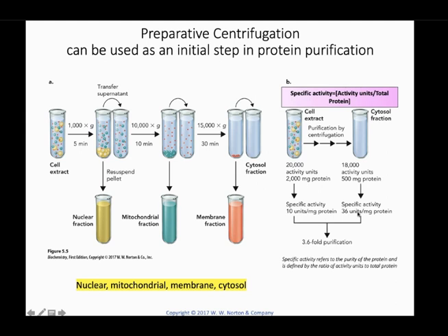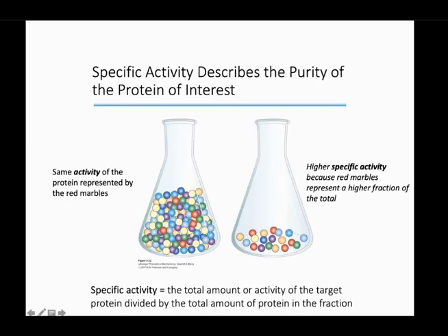Okay, so you're going to be purifying in all the steps that you have to do. And here's basically how they explain. So you have your protein. Imagine that you're looking for this protein that is represented by the red little balls right here, or marbles. Here you have activity, but obviously you have other proteins, right? It's not pure. You have other things that you don't need, and it's holding down basically the specific activity of your protein.